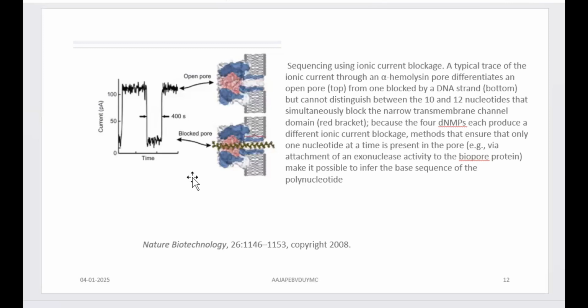If you talk about graphene, then graphene is a monoatomic layer of carbon grid structures. They are really good when it comes to electrical conductivity and malleability, etc. Of course, it can also withstand experimental parameters very well, say pH, temperature, ionic solutions, etc. And unlike silicon, graphene is stable as a monolayer system and can exist as very, very thin membrane structures. So a 0.3 nanometer structure also can be assembled.